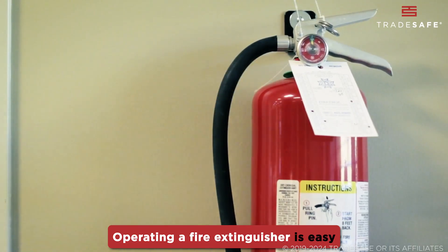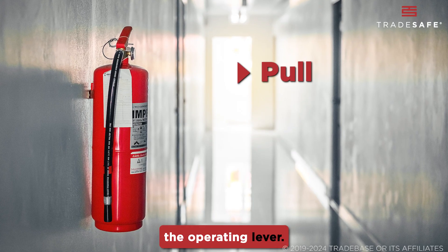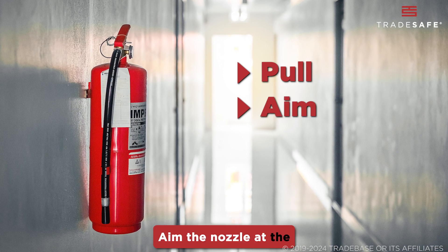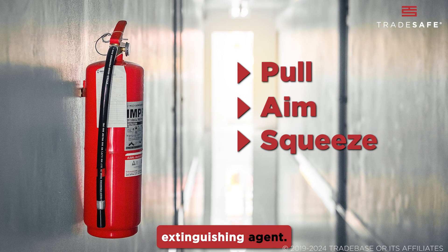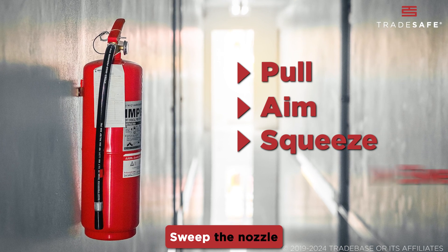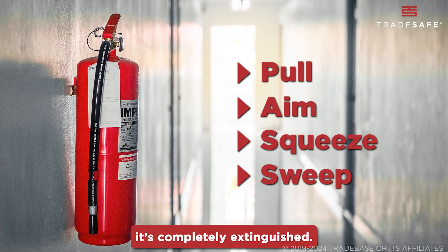Operating a fire extinguisher is easy if you remember the acronym PASS. Pull the pin to unlock the operating lever. Aim the nozzle at the base of the fire. Squeeze the lever gently to release the extinguishing agent. Sweep the nozzle from side to side, covering the area of the fire until it's completely extinguished.